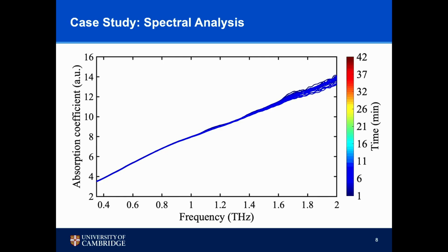And now I will show a set of data, to show how we process it through the steps. These are the spectra we acquired by the Terahertz spectrometer along the time. As you can see at the beginning, because we only have pure liquid solutions in the flow cell, and the dielectric relaxation of the liquid is not coherent, the spectra is more like a straight line.